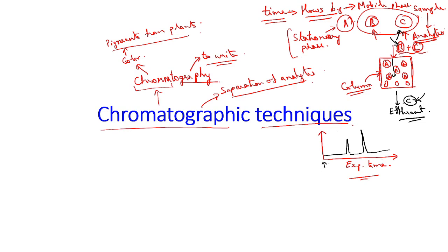So while we have been discussing this party example, we have talked about certain points. The first point we talked about is the column. So in a chromatography, there will be a housing or there will be a base. The housing or the base may be a column, it may be a TLC plate over which you will be applying some silica gel, or in a very simple case, it may be a filter paper where you go for the filter chromatography.